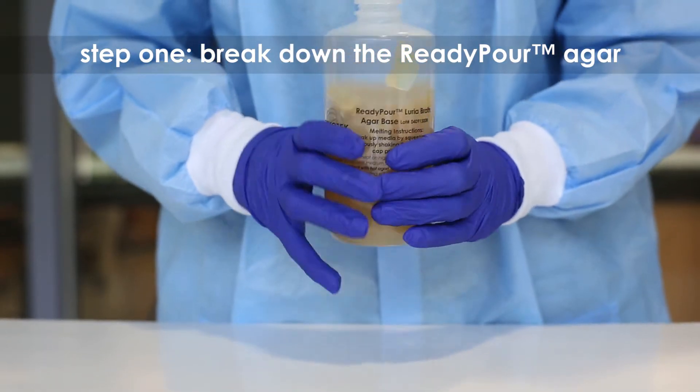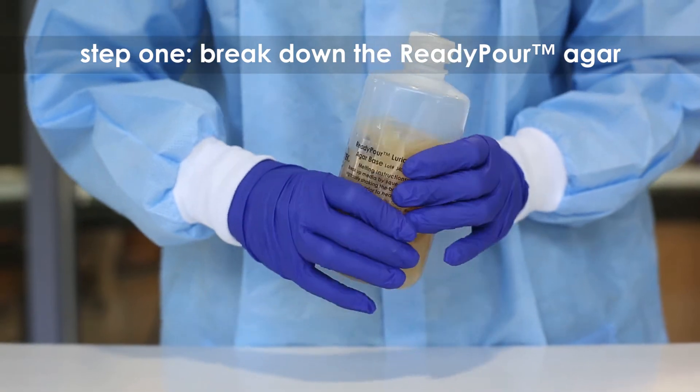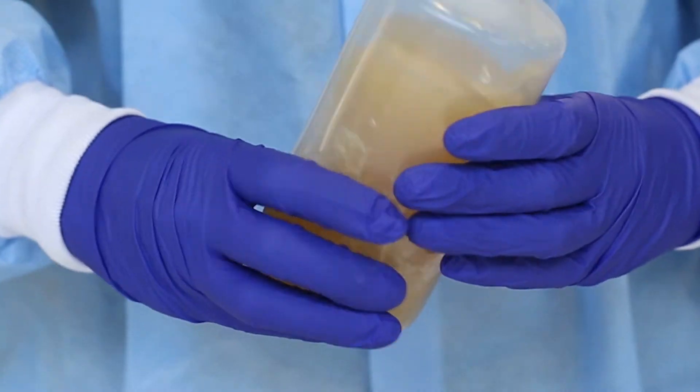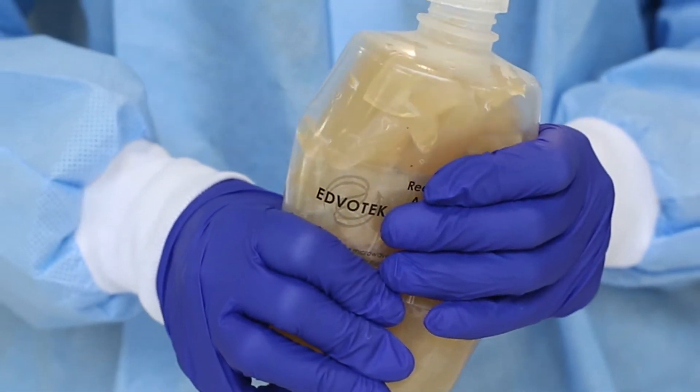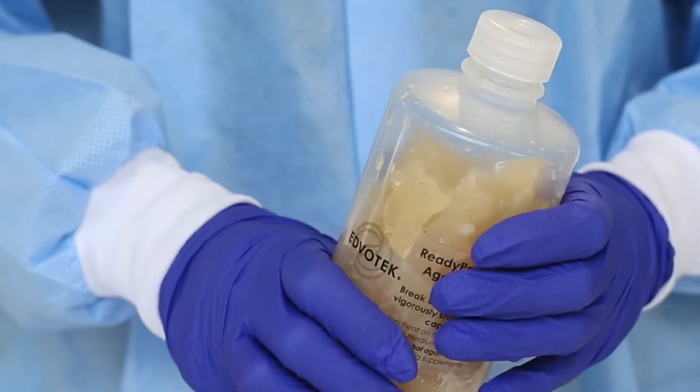Step 1: Break the solid ready-pour agar medium into small chunks by squeezing and shaking the plastic bottle. One large bottle of ready-pour will make five large LB source plates and 40 small plates.